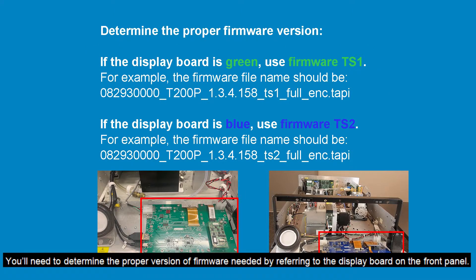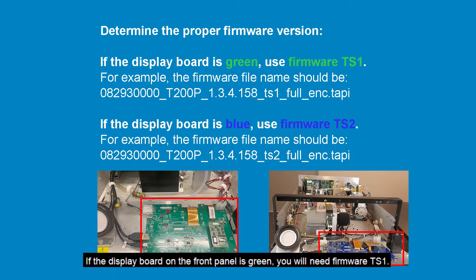You'll need to determine the proper version of firmware needed by referring to the display board on the front panel. If the display board on the front panel is green, you will need firmware TS1. If the board is blue, you will need firmware TS2.